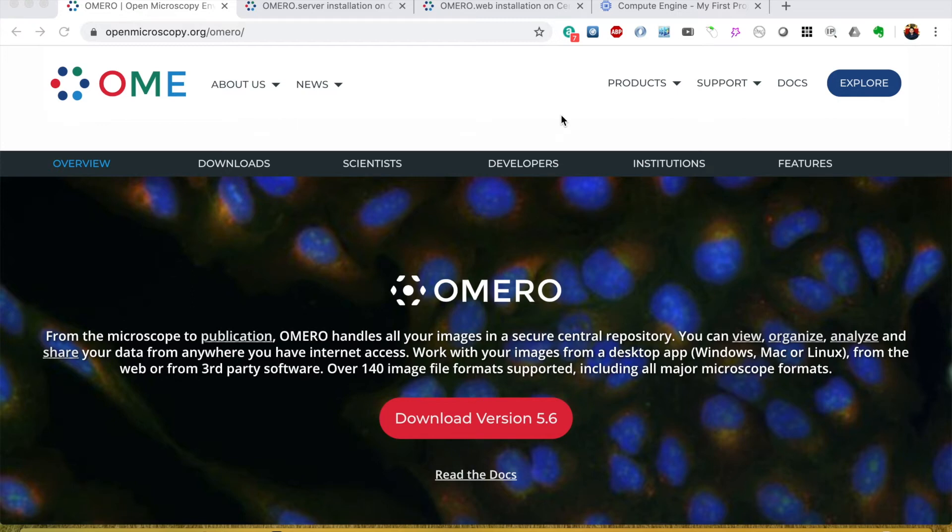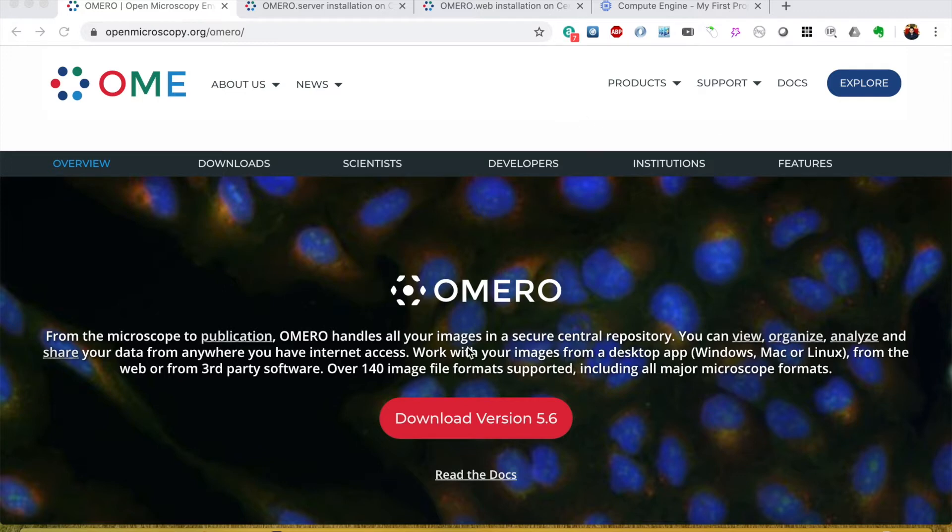Today I will show you how to install an image storage tool called OMERO. It's a very interesting tool which can help you in viewing, organizing, analyzing, and sharing data.